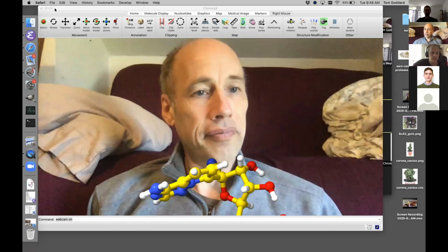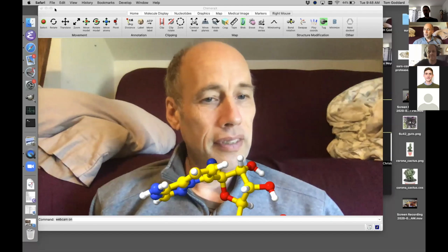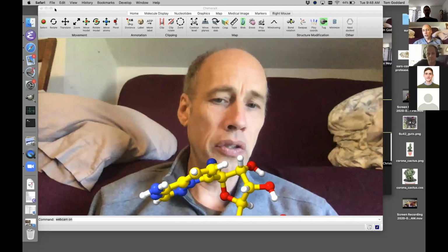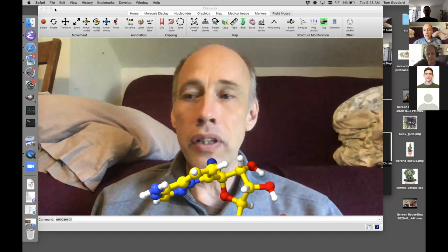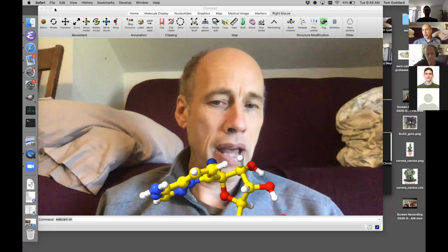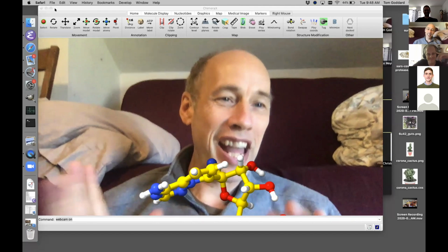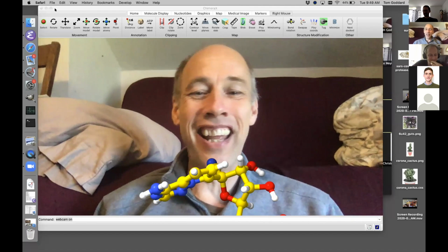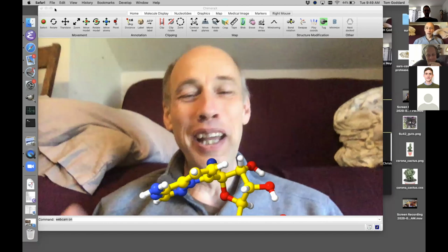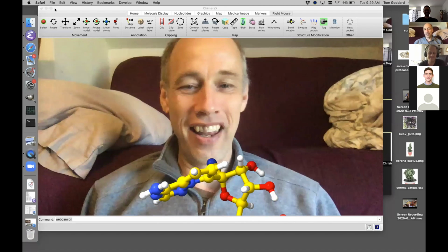And maybe a follow-up stretch thing: what do you think about Linux and webcams? It should work on that too, and you can try it right now in the daily build. It might work. It's just that I wrote this code just on Sunday, so it's really brand new. Who knows what errors you'll get if you try anything other than a Mac laptop. I haven't even tried on a Linux system yet.